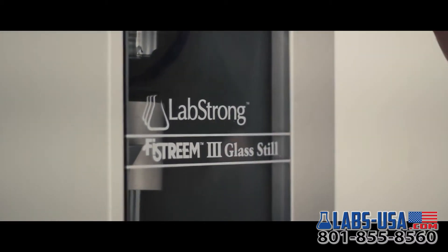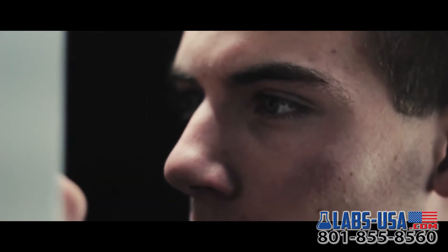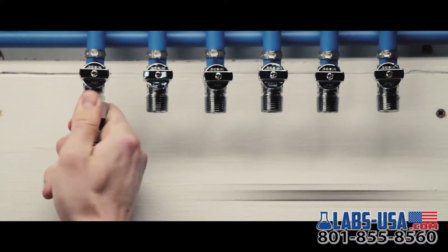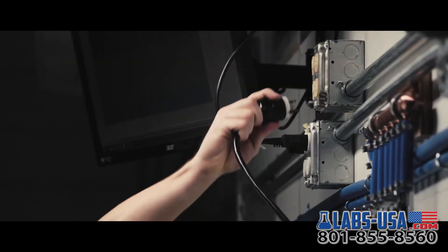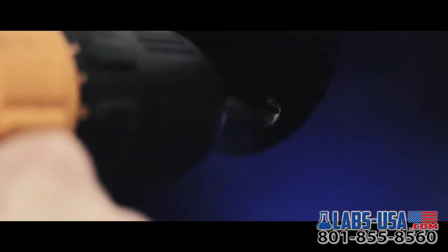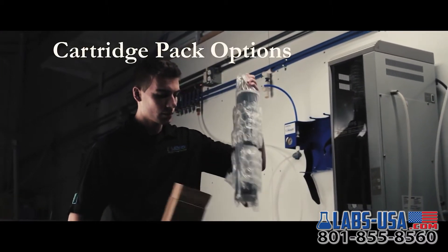Every lab is judged by its consistent repeatable results. To obtain those results we must start with consistently pure water. The Phi Stream stills install easily with basic tools and ships with the wall installation bracket. Multiple sizes are available at different voltages to fit your purification needs. The Phi Stream is also uniquely plumbed to accept pretreated water, which greatly reduces water consumption.